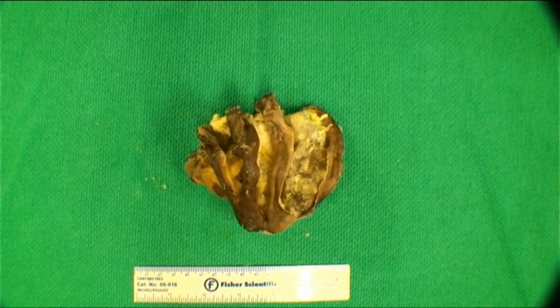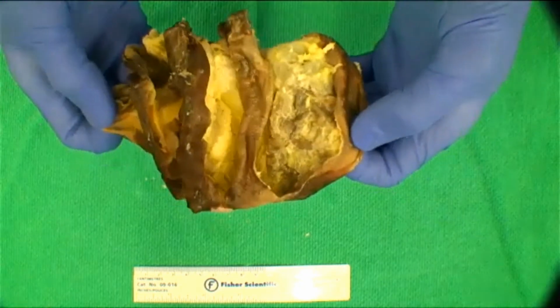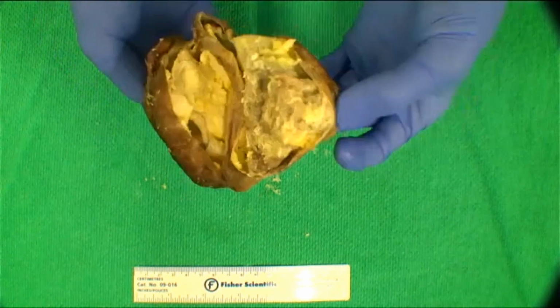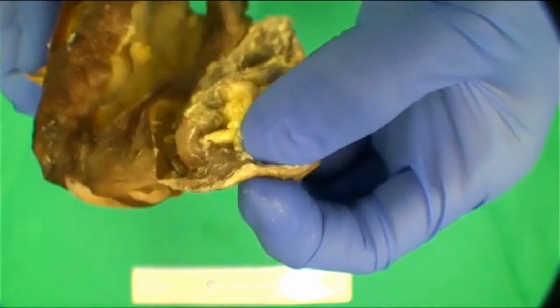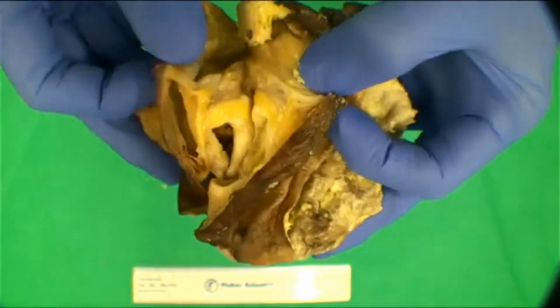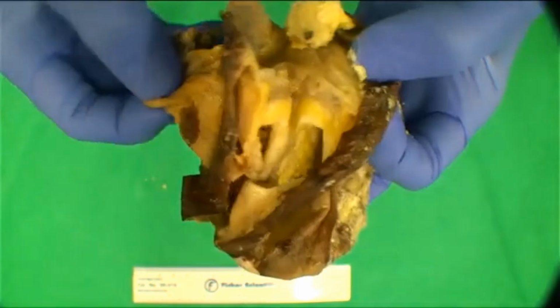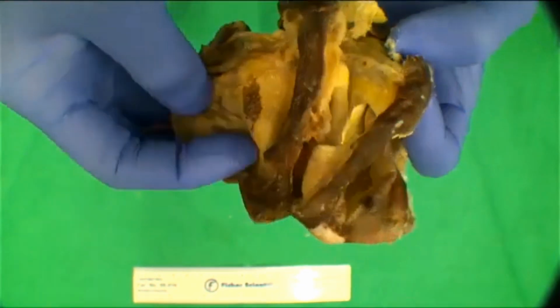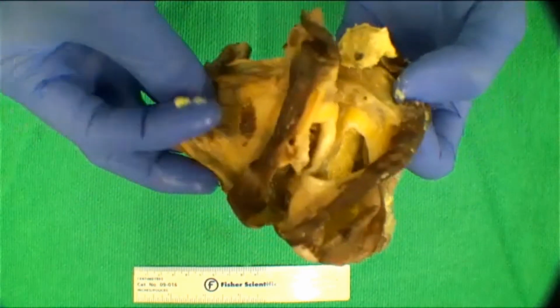Okay, did you want to just go about how we're going to gross this? From a grossing standpoint, we would measure the specimen in 3 dimensions, talk about the contents of the cyst. Most often, these are very thin-walled cysts, as you can appreciate here. They're not very thick, but when you do get to the thicker areas, you do want to be aware of these Rokitansky nodules and protuberances, describe them as such, and then sample them. You're still looking for some of the papillary excrescences that you would see in any of the other cystic lesions of the ovary. And if they're there, you would describe and submit.